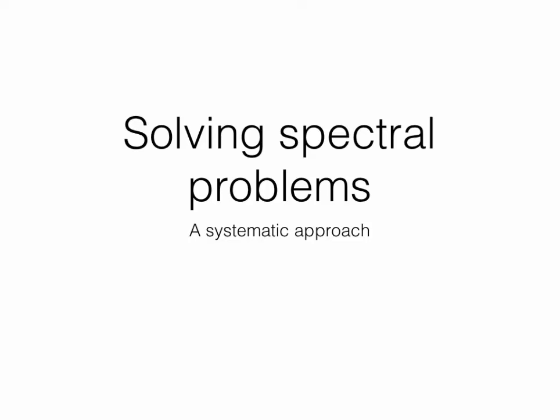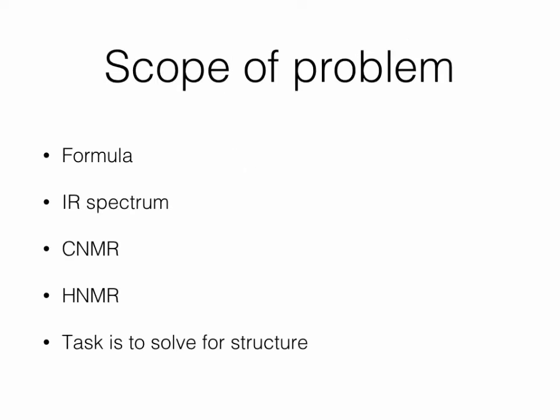The purpose of this video is to begin to give you some advice about how to take a standard spectral set of problems and go about solving the structures. There's no one way to do this, but I think if you keep things in this presentation in mind, you'll find that things are a good little bit easier to at least get started on.